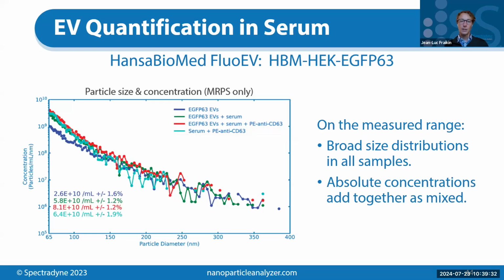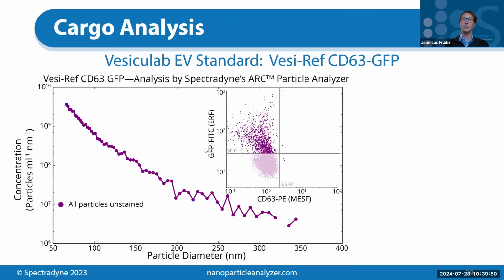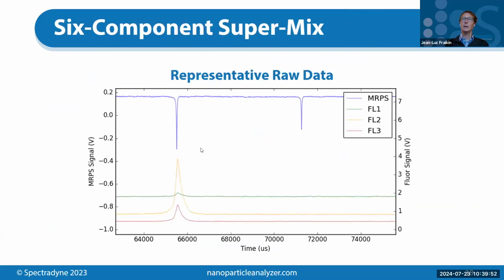All right, so there's a question in the Q&A. You mentioned in the beginning of controlling the particle size to enter. So I'm assuming that's about the filters. And then the question is, what is the minimum size that can be entered, and how exactly do you control to enter one size at a time? Okay, so a couple of parts to that question. Let me just go back up to the diagram because I think it's helpful.